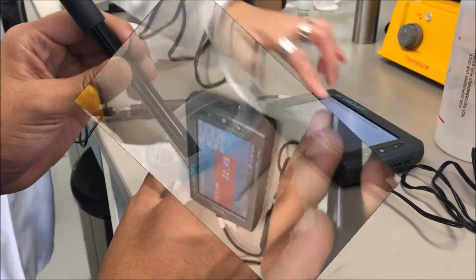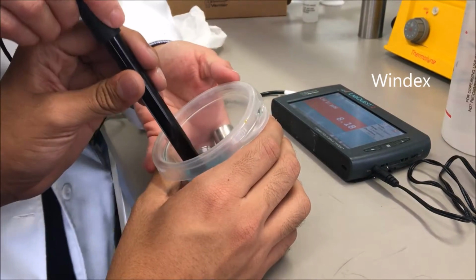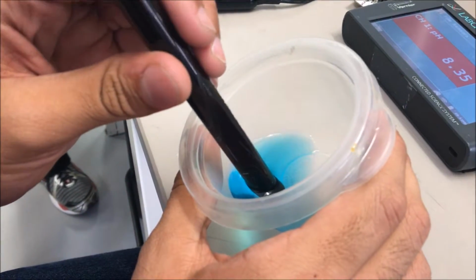After making this experiment, we can conclude that the pH meter is more useful than the universal indicator, because with the pH meter we can have a more exact number of the acidity or alkalinity of a substance.